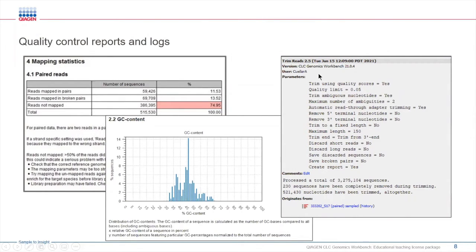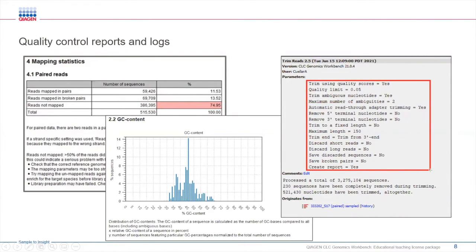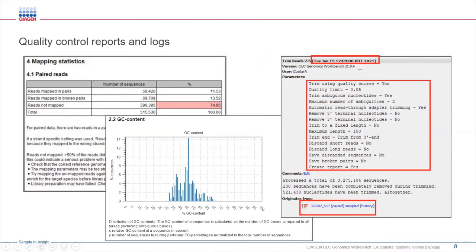Here you can easily just refer to this log to see what parameters were used when you ran this analysis. What files were included when this analysis was done, and then what version of the workbench was used.